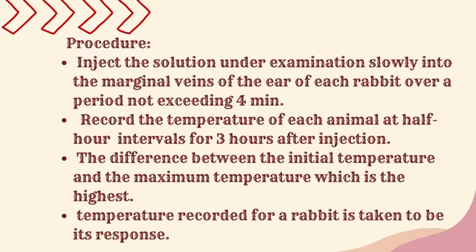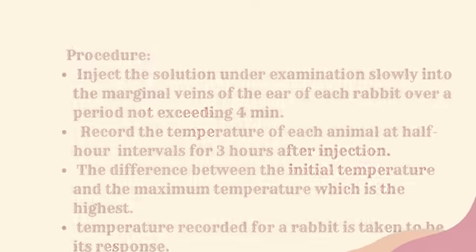The difference between the initial temperature and the maximum temperature, which is the highest temperature recorded for a rabbit, is taken to be its response.